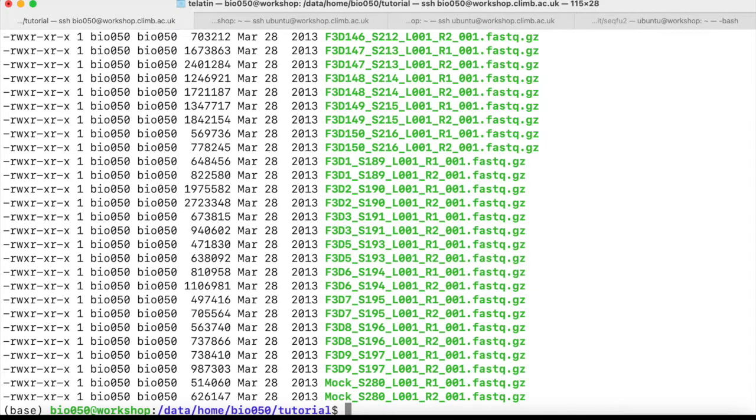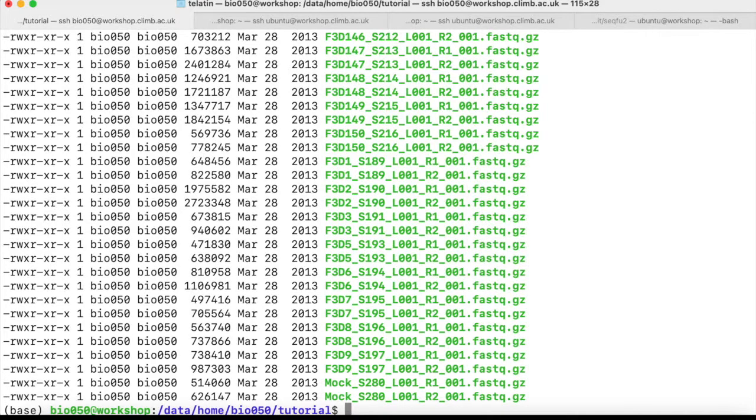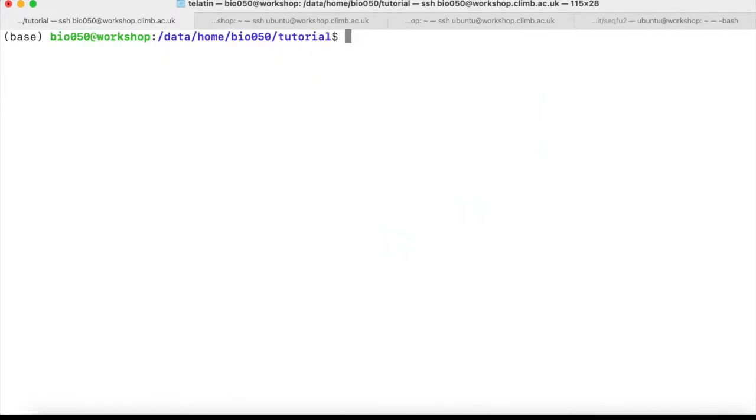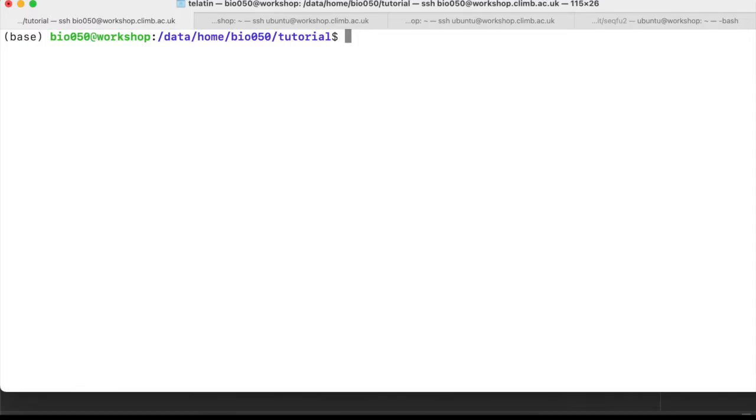So if we are in this situation, then we can simply use the import method that is based on the standard output of a demultiplexed Illumina run.